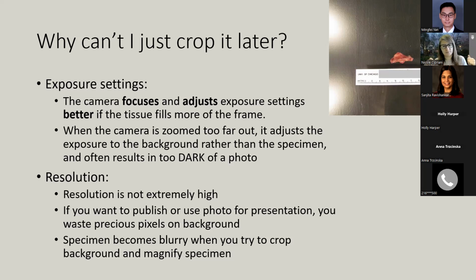The other thing is when I zoom in, it fixes the exposure and the specimen becomes much brighter. If you have exposure settings that you can change, then that's probably not an issue. But if you're doing automatic stuff, it becomes an issue.